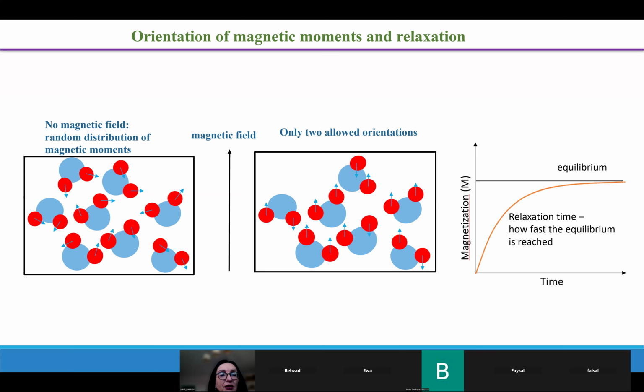I'm risking at this moment because I fear that you might start thinking that NMR is about water, and then one must have water to perform NMR. Actually, it's not true. However, water is the simplest molecule and a very common molecule, and somehow this is a good example. So everybody knows that a water molecule includes 1 oxygen atom and 2 hydrogen atoms. I think so far this is simple.